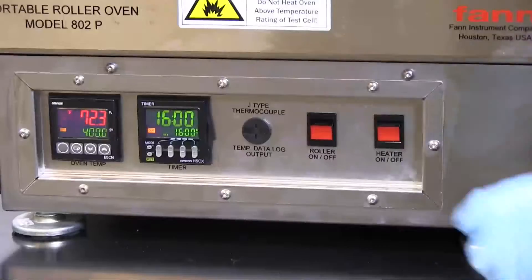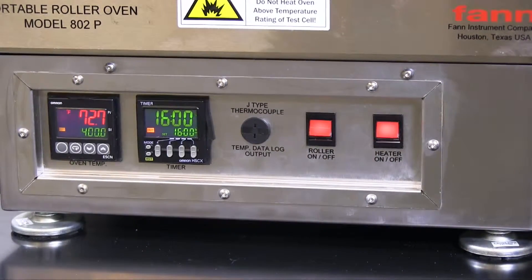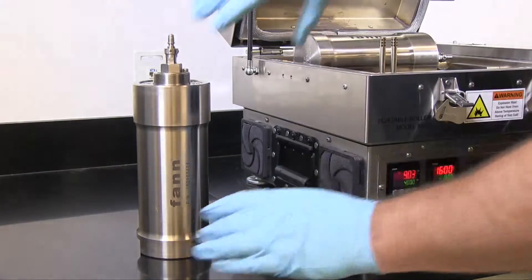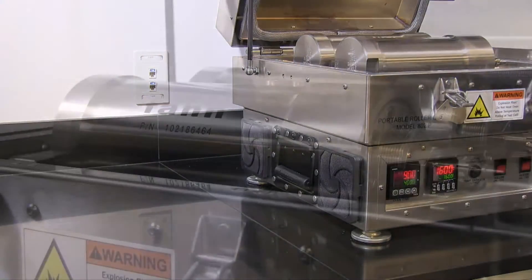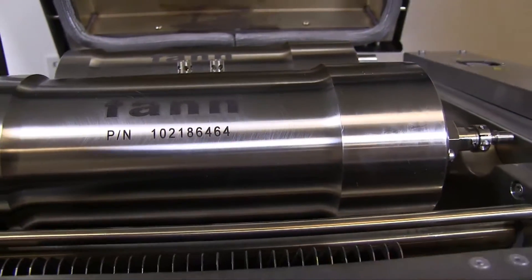The oven is equipped with a fail-safe over-temperature sensor that shuts down the oven heaters when the internal temperature exceeds 625 degrees. The only aging cell recommended for this oven is a 550-milliliter stainless steel cell built to the American Society of Mechanical Engineers Boiler and Pressure Vessel Code and certified for 600 degrees Fahrenheit and 2500 PSI pressure.